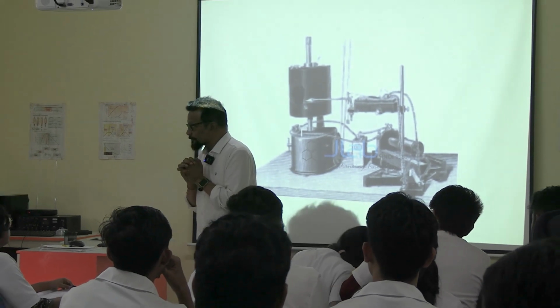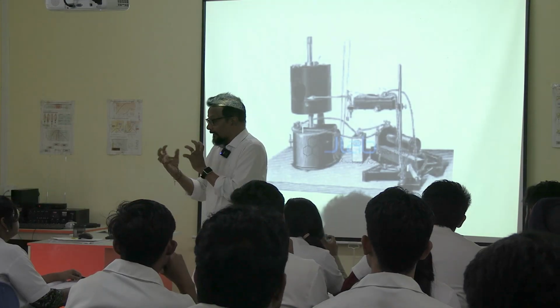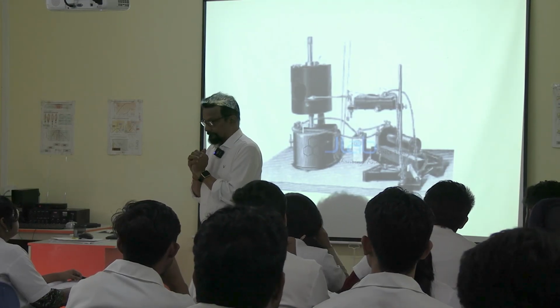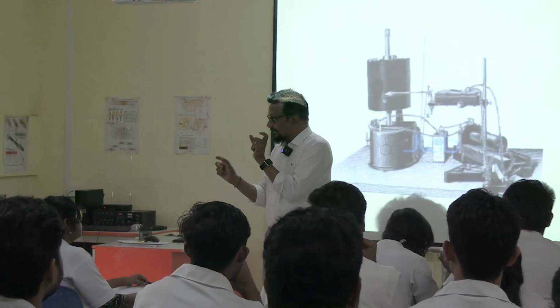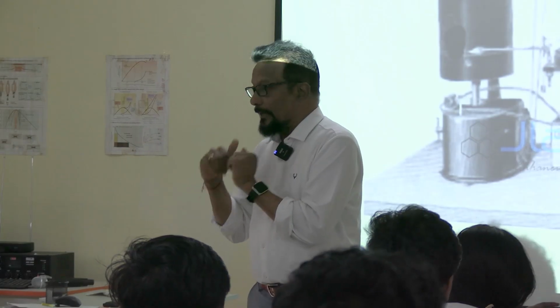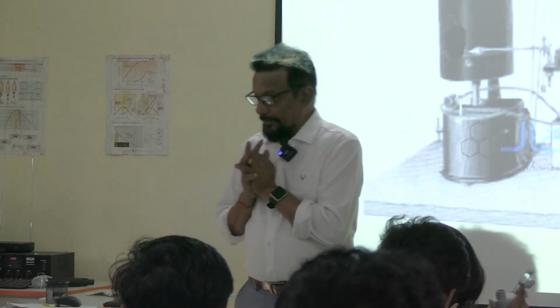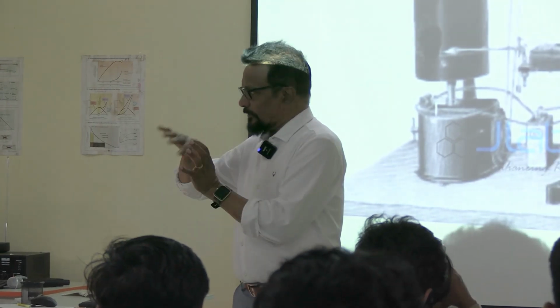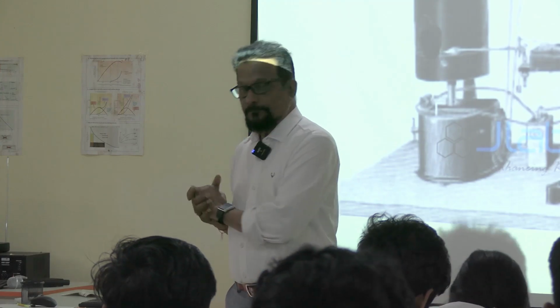First, we need the tissue, meaning nerve and muscle, and that should be in a living condition. The animal may die, but the cells have to remain in a living condition for a certain period of time. So how we can manage that for a certain period of time, that we will see.